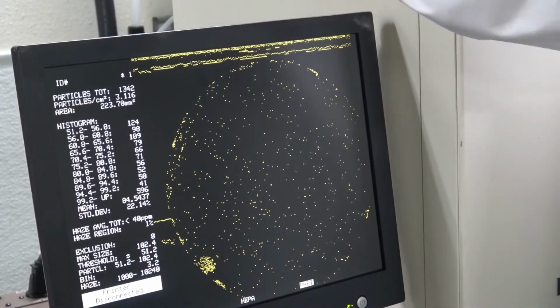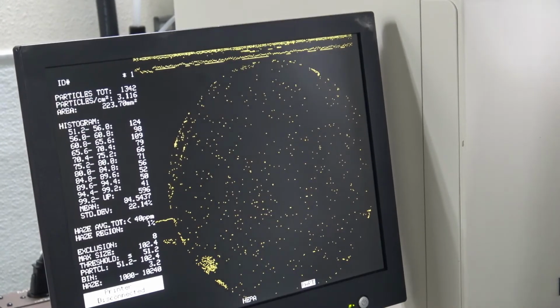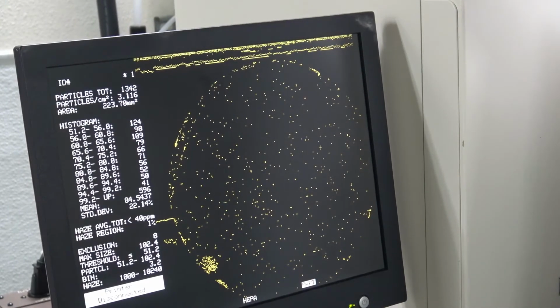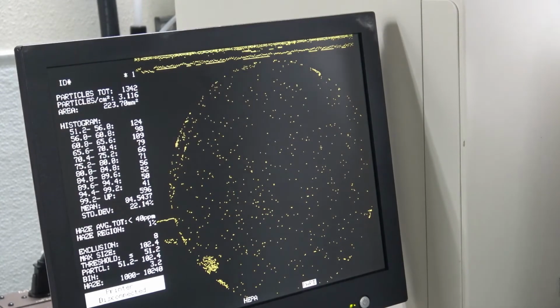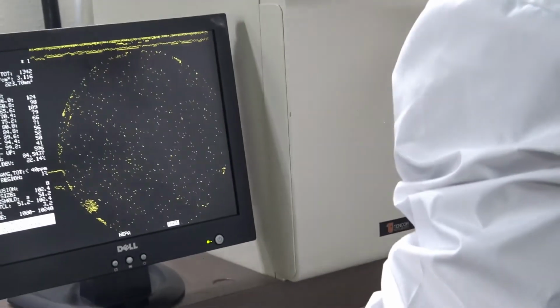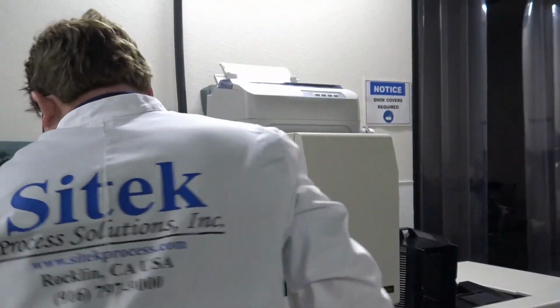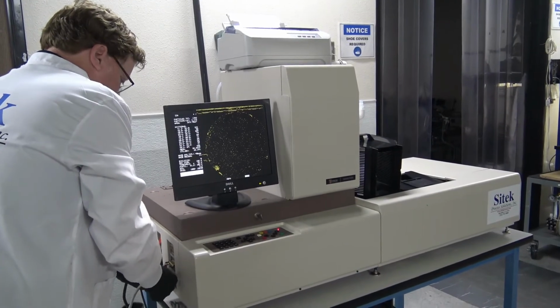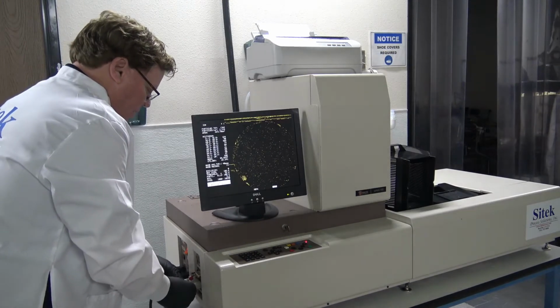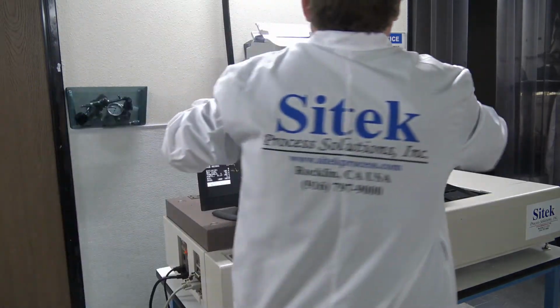Let's see. Have I indexed my paper yet enough? Let me load it again. Sorry. Oh, printer disconnected. So sometimes on the printer, you have to reconnect it. Let me just type that in. Unfortunately, when the printer disconnects, usually in the past, I've always done a reset of the tool, but I'm not sure if I have to do that on this one.